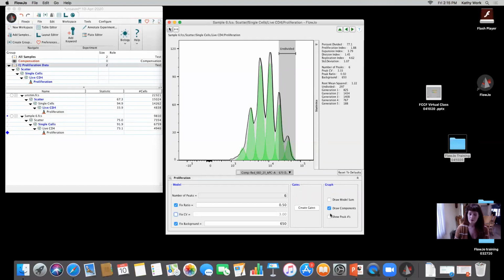Whereas cells are not beads, right? They're not hard dyed. They don't have an exact number of molecules on there, or photons of light that are given off as soon as the laser hits it. So you have to think, all right, beads are beads, cells are cells, they're going to behave differently. It's a great question, but the CVs are absolutely going to be a bit different.